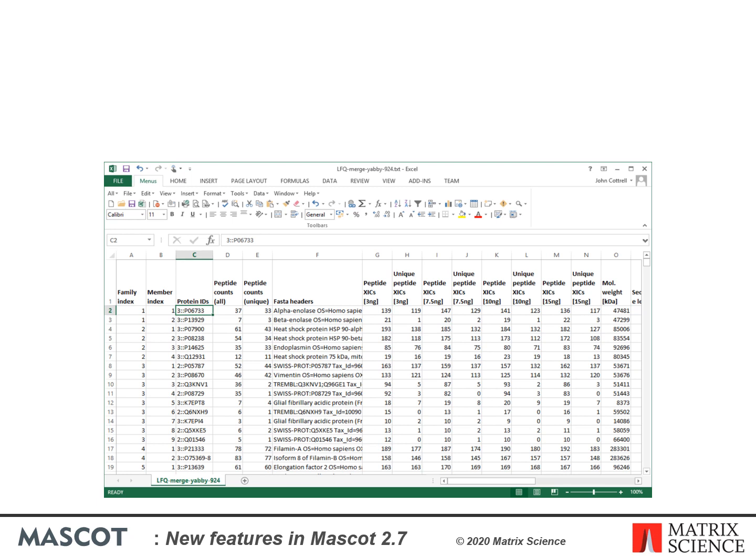Go and see the presentation if you would like to see examples of what you can do with the output. If you would like to know more about cross-linking or the changes to modification detection, check out those respective presentations as well.